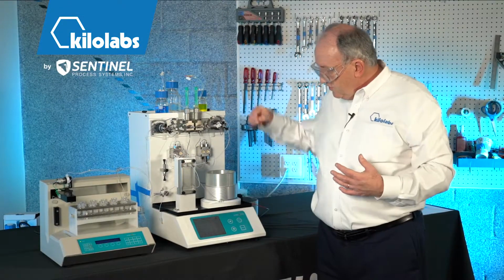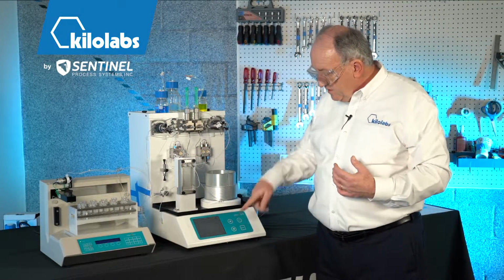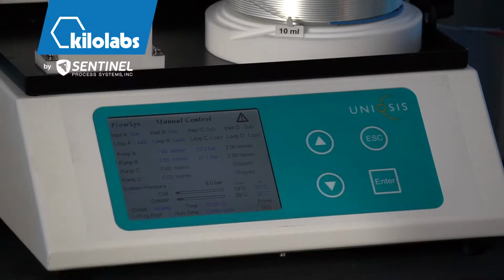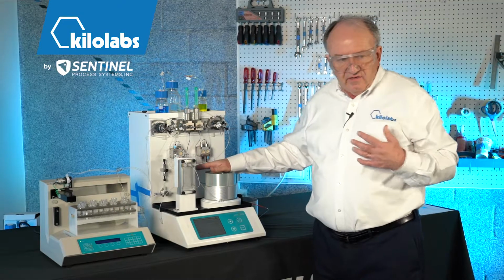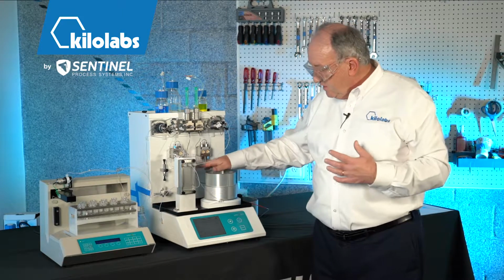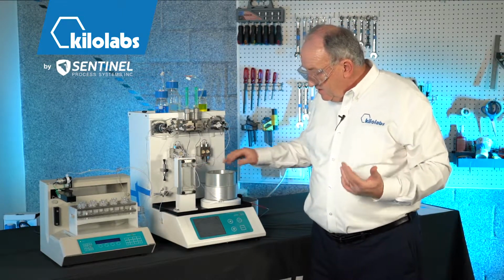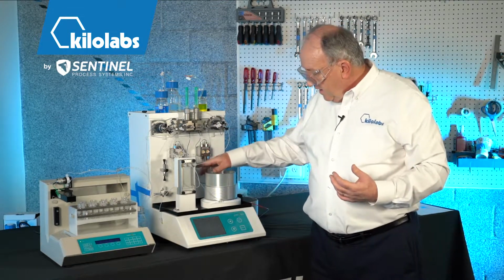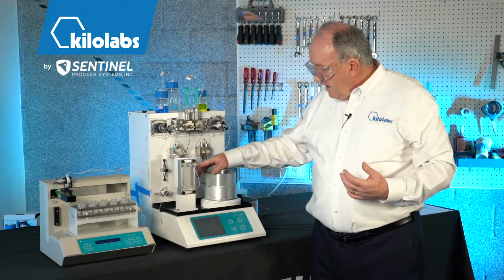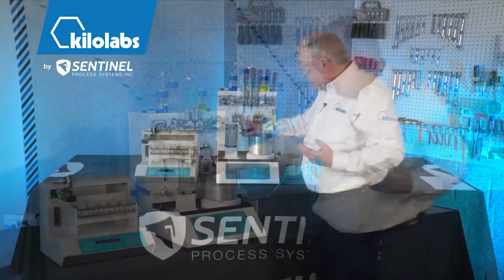So now I started the pumps up, and what you can see on the screen is that the pressure at each pump is measured. There's a pressure transducer behind each pump that's telling what the pressure is, and also a system pressure where we're actually measuring the pressure intermediate between the mixing chip and the coil. You could configure the tubing and piping to put this pressure measurement wherever you want in the flow system. So in essence, what this is telling us is at 2 ml per minute, I've got 20 bar at the pumps, and I've got 9 bar after the chip. So the pressure drop across the mixing chip is 11 bar, if that's of interest to you.